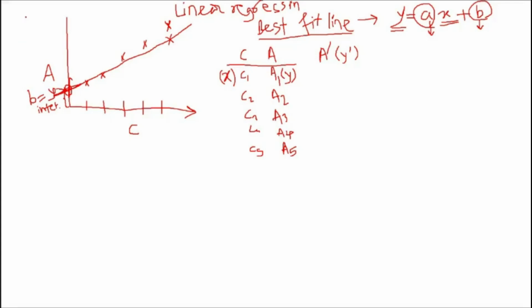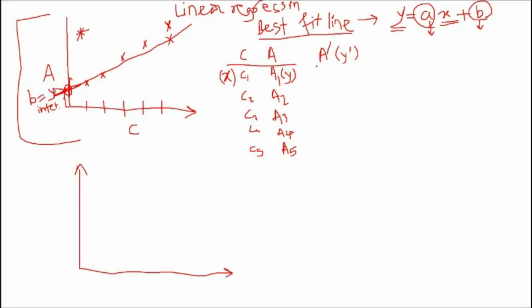For time being, consider that this graph we will draw only after calculation. We will first do the corrections in the absorbances and then we will plot the corrected graph, where all the points are on the line.